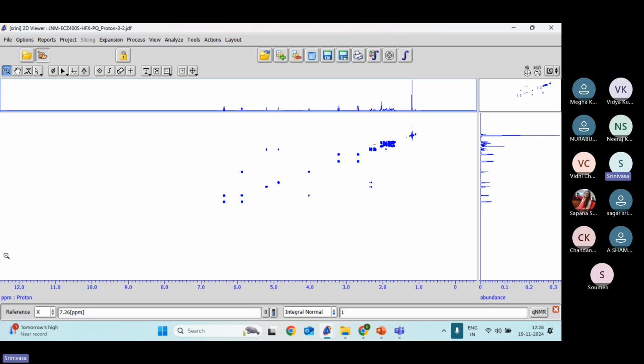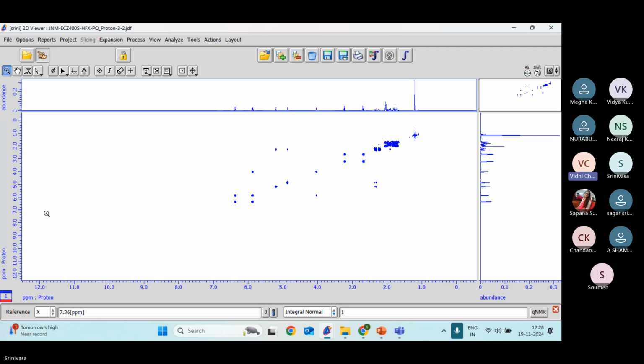Now you can see the side Y, the Y scale is not visible. To bring the Y scale, press Alt Y, and the Y scale is brought. This keyboard command works only with the caps off condition. If caps lock is on, this will not work. Please turn off the caps lock, then try this function.